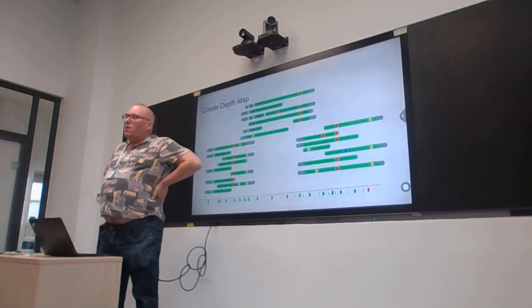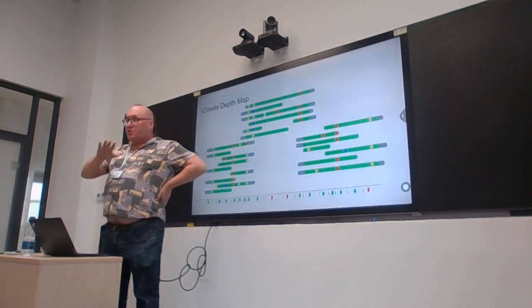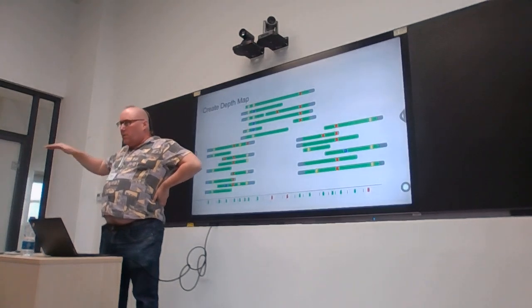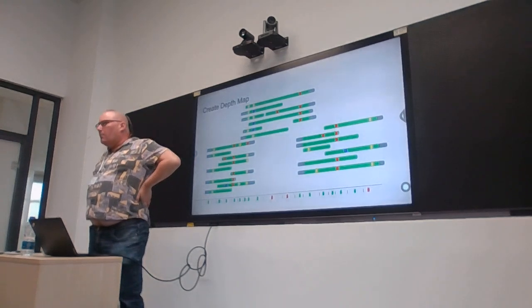That's interesting. In general, the results that I've seen are still consistent that higher CT value means lower coverage. Still, in general, there can be some exceptions, but the trend should always be that way. So when you were sequencing SARS-CoV-2, did you not put a cutoff? How did you choose your samples?